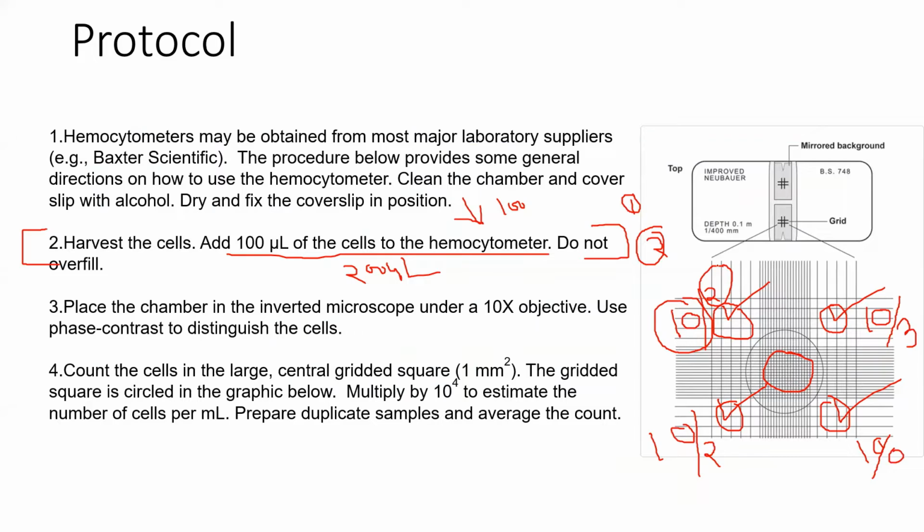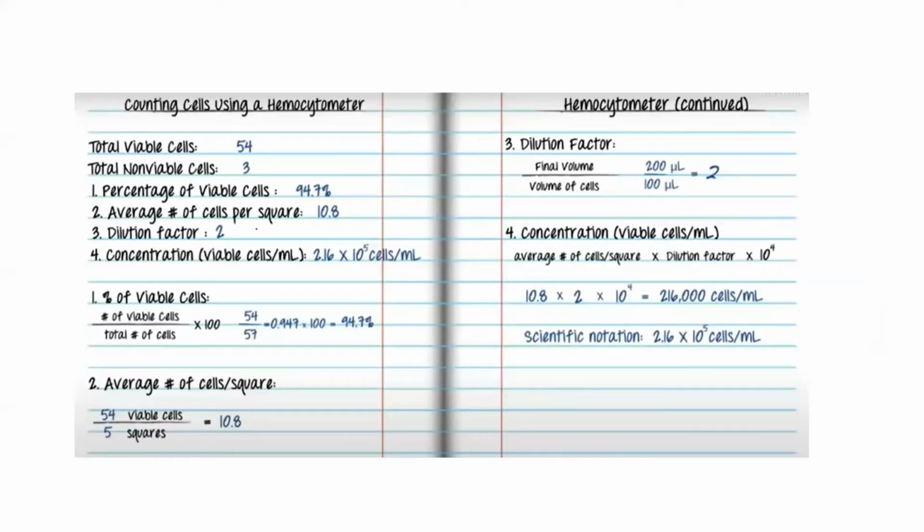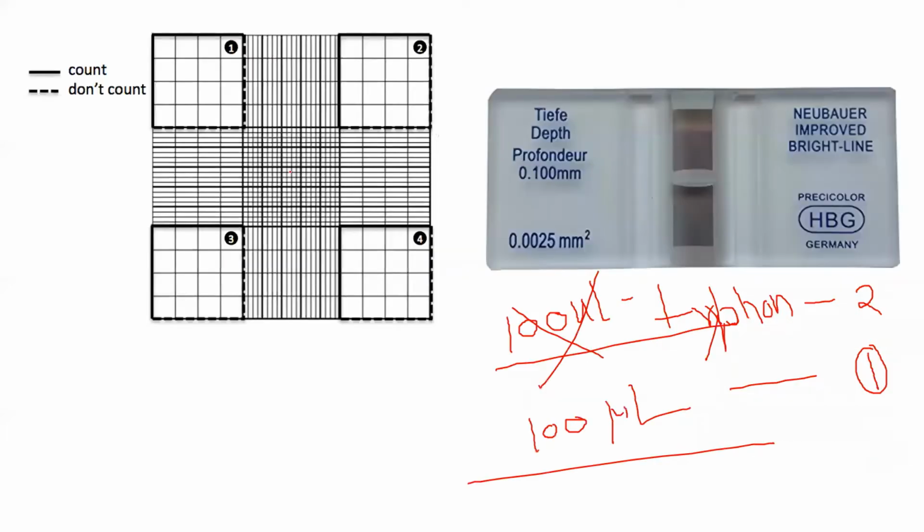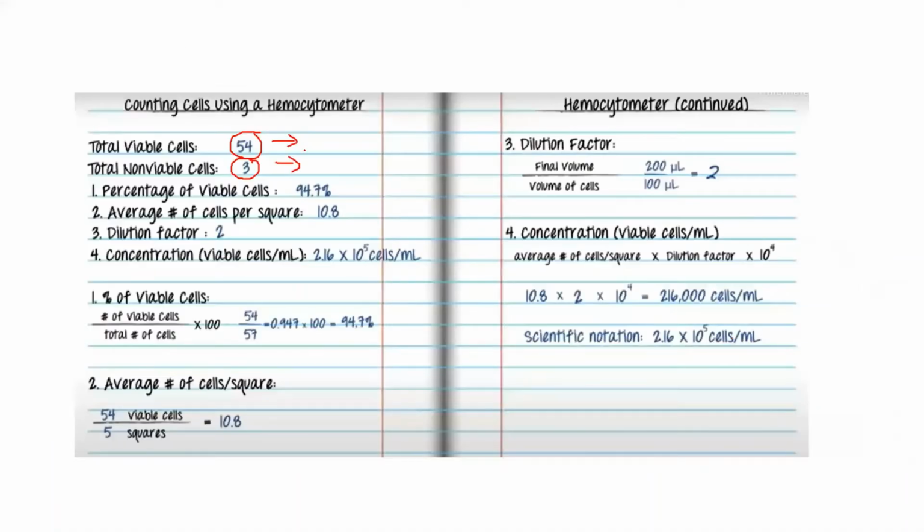Let's do it on our own. For example, let's open the calculator without touching the application. For the first circle, we need the total number of viable cells and the total number of non-viable cells. So let's take our own numbers. What is the total number of viable cells? 10 plus 10 plus 10 plus 10 is 40, right? So let's put 40. We have 40 viable cells, okay?